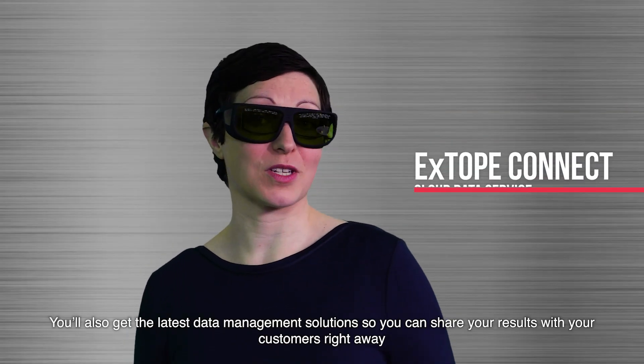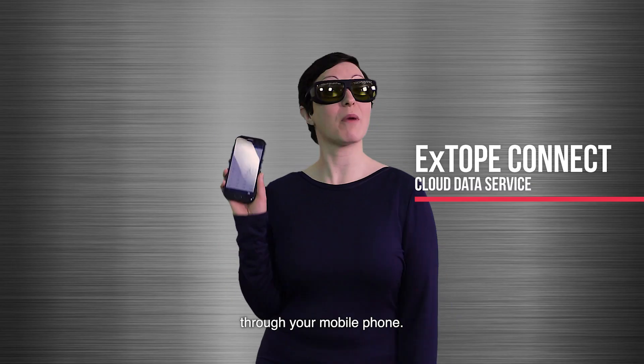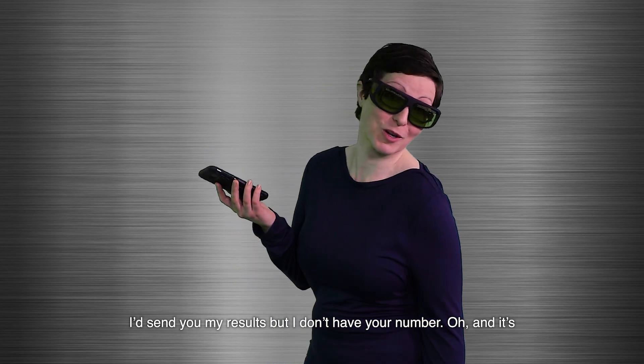You'll also get the latest data management solutions so you can share your results with your customers right away through your mobile phone. I'd send you my results but I don't have your number.